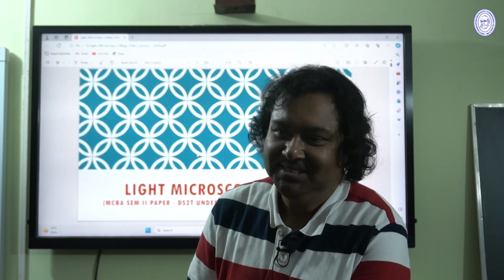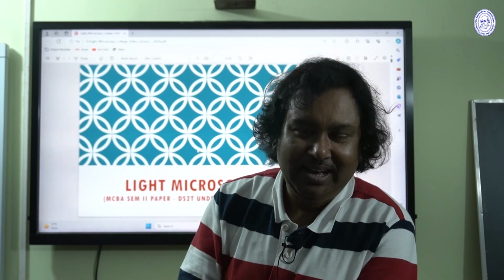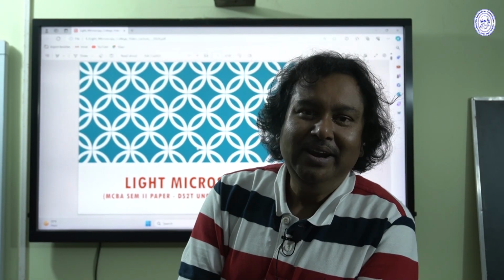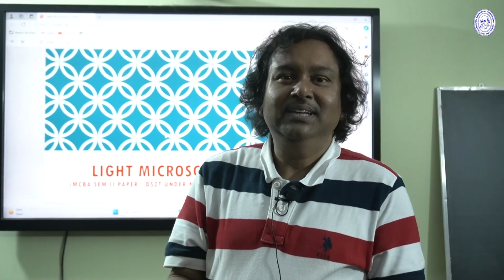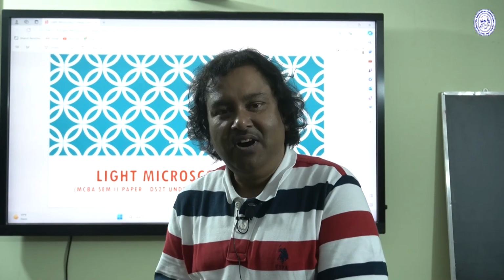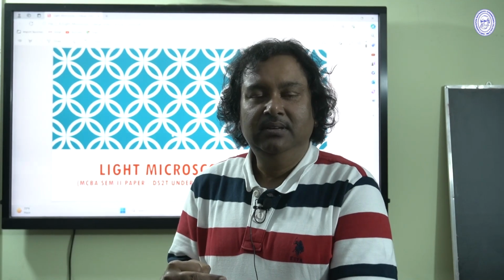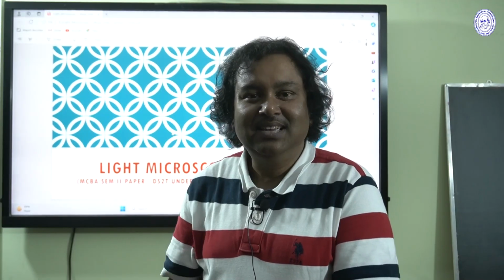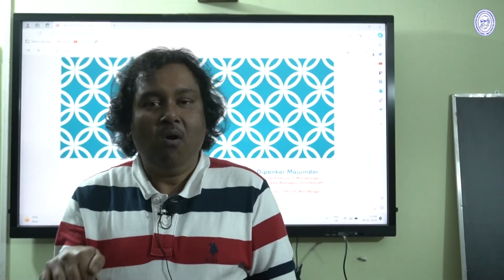We, the human beings, are able to see the objects around us, in us, on us, with the help of our eyes. Many objects that are very tiny cannot be seen with our eyes. So, to see tiny objects like bacteria, viruses, fungus, or cells, we have to use some specialized instruments. This is simply known as the microscope. And today my lecture is on light microscope.